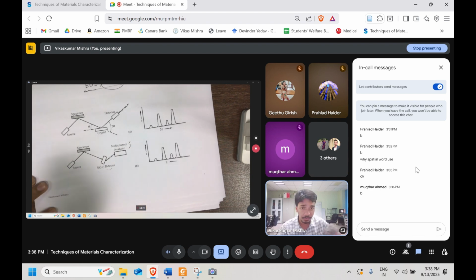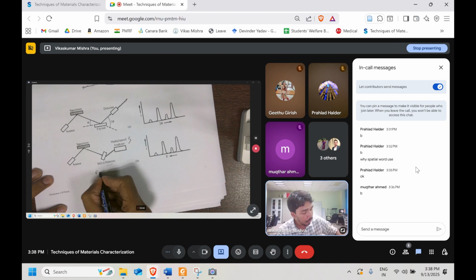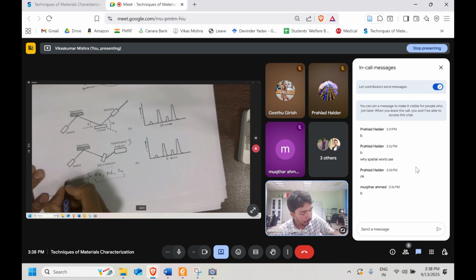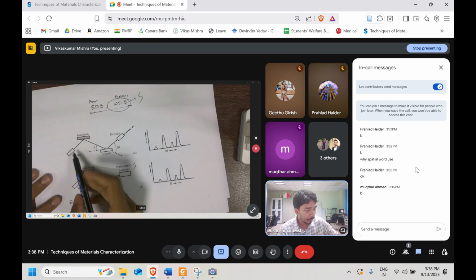With the multi-channel analysis, which we saw earlier, let's say you have observed in your specimen that aluminum is there, iron is there, copper is there. These things are present in your specimen. This information you got from the EDS. Now let's go to the WDS.